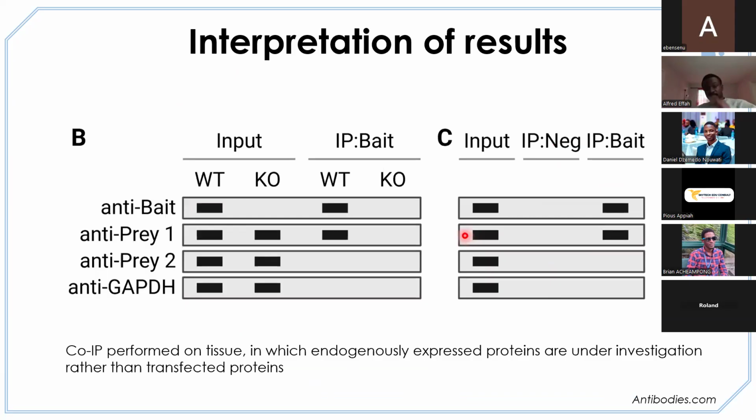So now another example here, let's say we take a sample like mice. We take a tissue from mice. You can take any tissue at all, prostate tissue, breast tissue, and then you have your inputs. What will you use as a control? So we have wild type. Wild type is the normal phenotype. Nothing has been changed. That is the usual thing that we have. So when you took the tissue, you didn't perform any alteration. That is the tissue. So we took breast tissue. All the normal proteins in breast, they should be there.